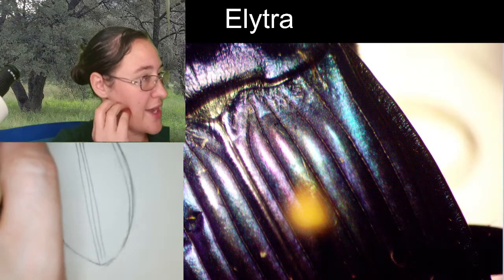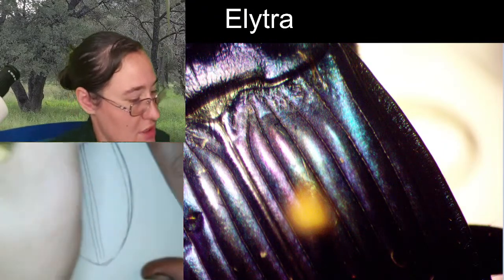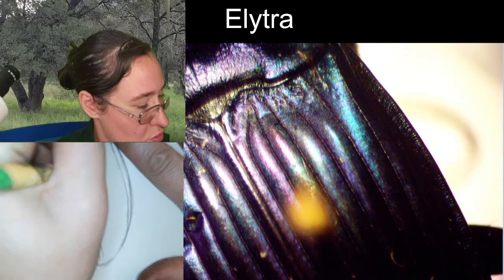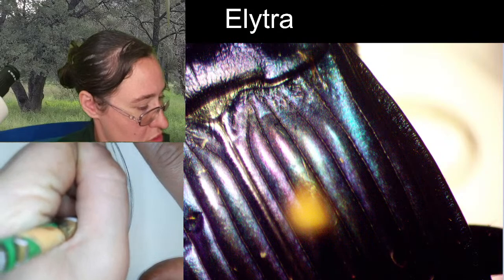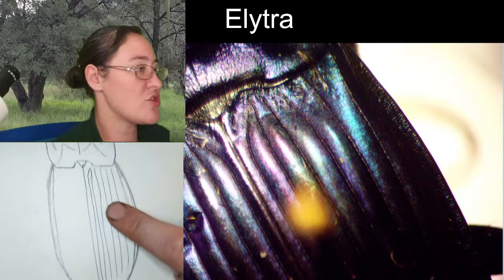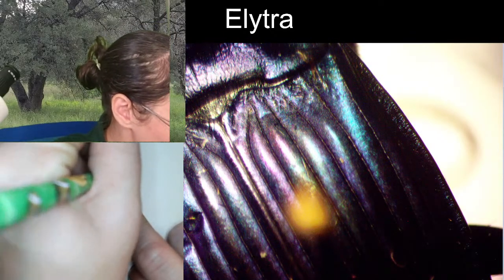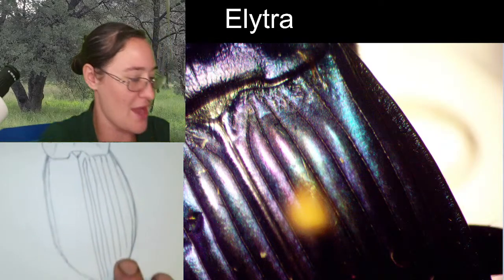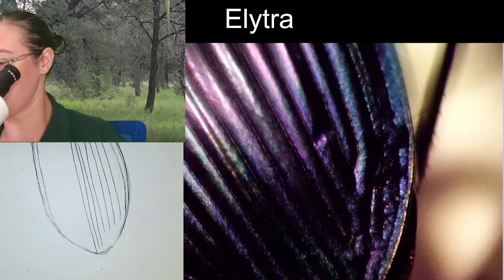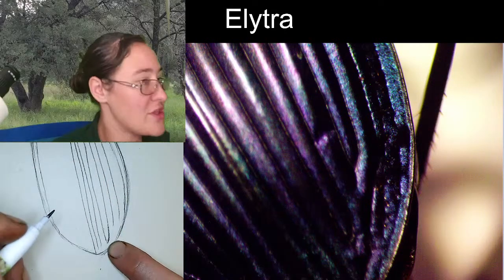I'm going to draw the 4 more lines from the top. They do run parallel. So I drew the 4 from the top. They are all separate after those first 2, and the striations do go underneath the pronotum. So I just went ahead and continued them back there. But I didn't finish the ends because I wanted to go back to what this looks like and connect them properly. So these next 2 come down and they connect together at the bottom.